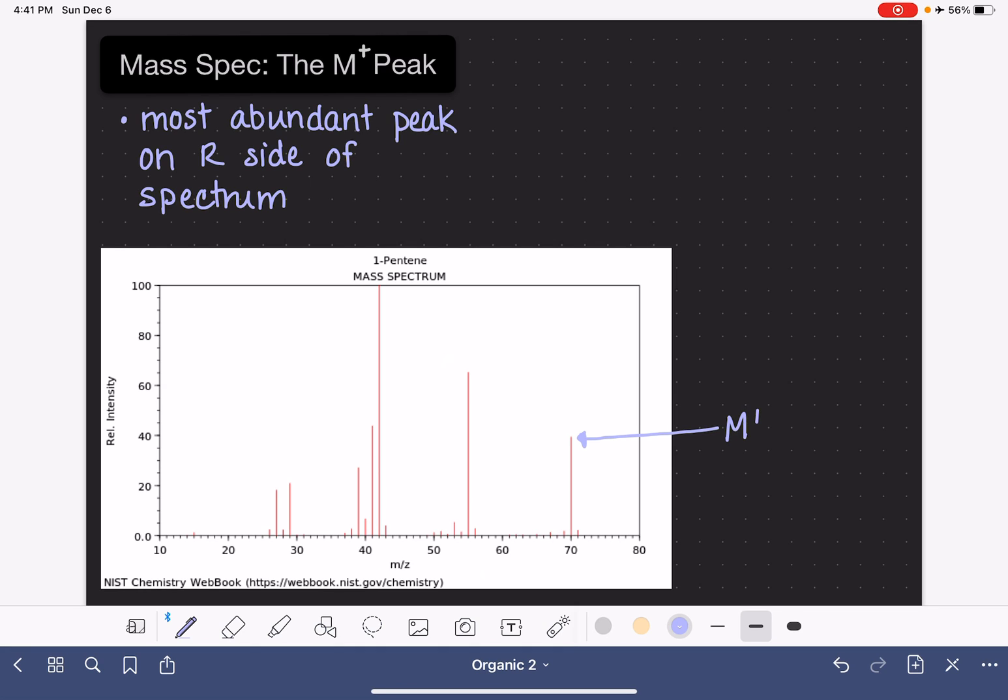This would be our M plus peak, and we can see that it corresponds to the number 70. This is the mass of the fragment or the portion of the molecule that's giving rise to this particular peak.